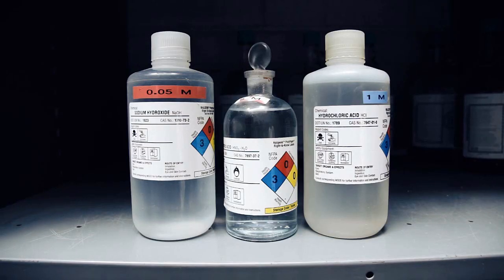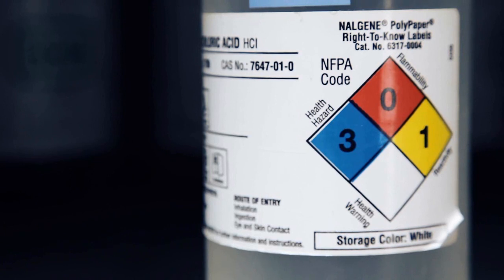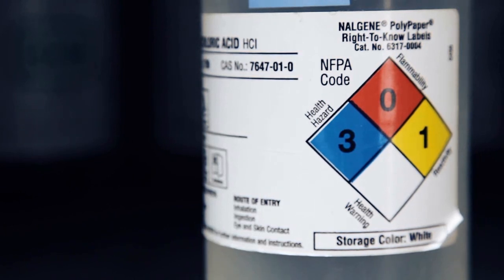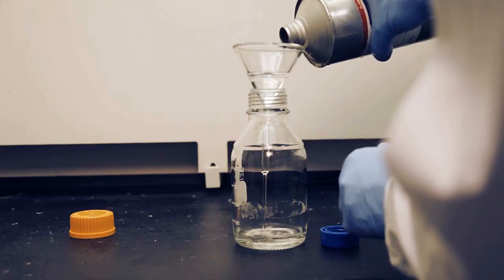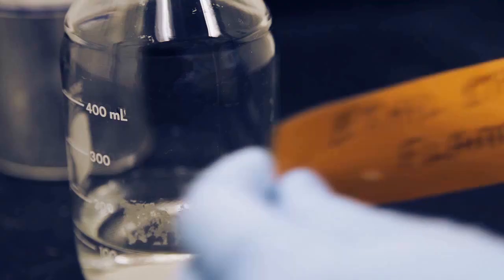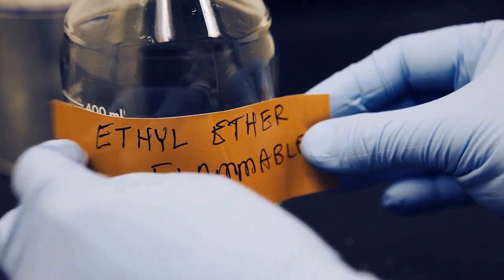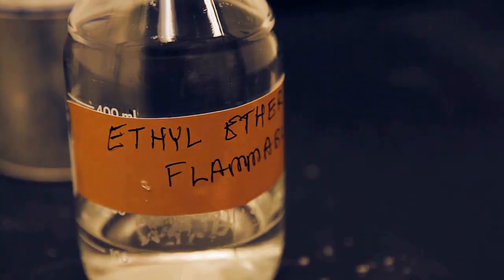Hazardous material containers must always be clearly labeled and include, at a minimum, the name of the contents in English and the health and physical hazards associated with the material. If chemicals are placed into an unlabeled container, that container must have a secondary label affixed to it. Just like other labels, the new label must also have the name of the contents in English and the health and physical hazards associated with the material.